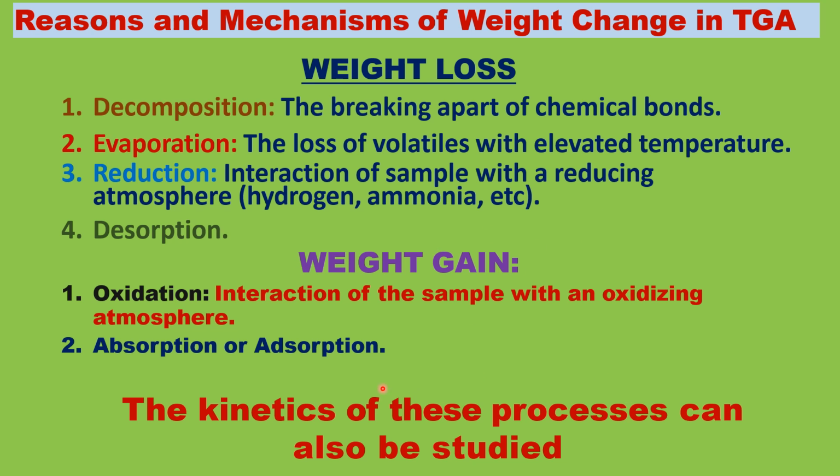In all these thermochemical reactions, the kinetics, the rate of the thermal process, can also be studied by the TGA technique.